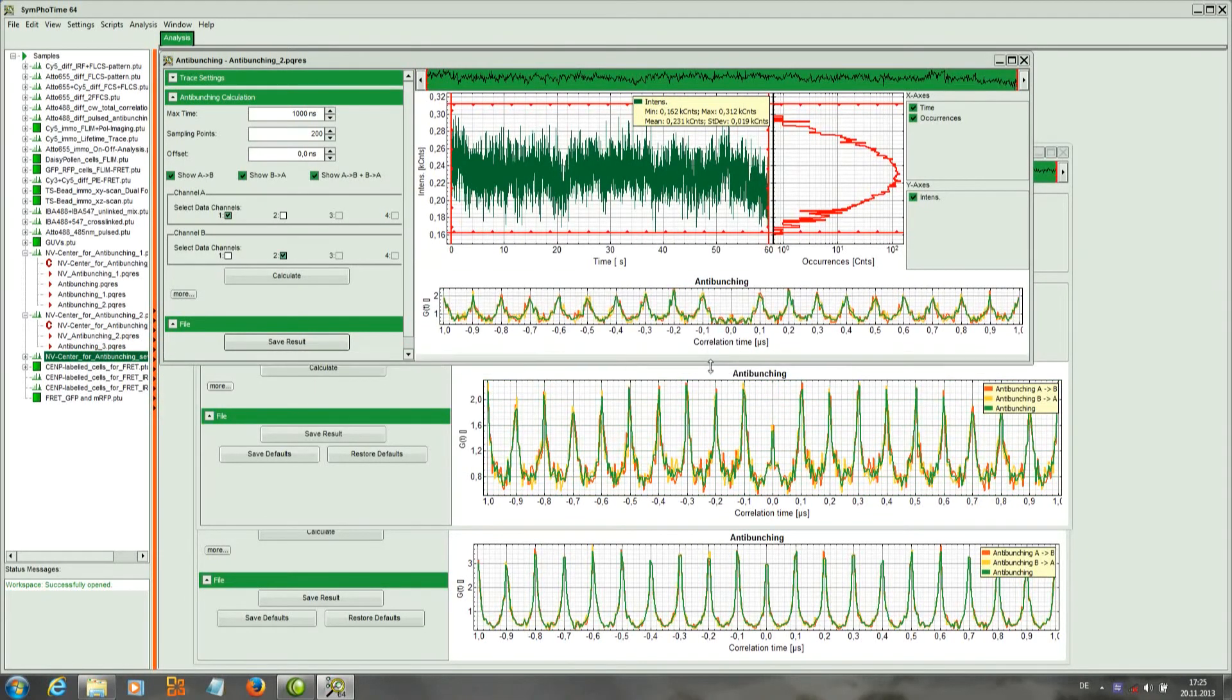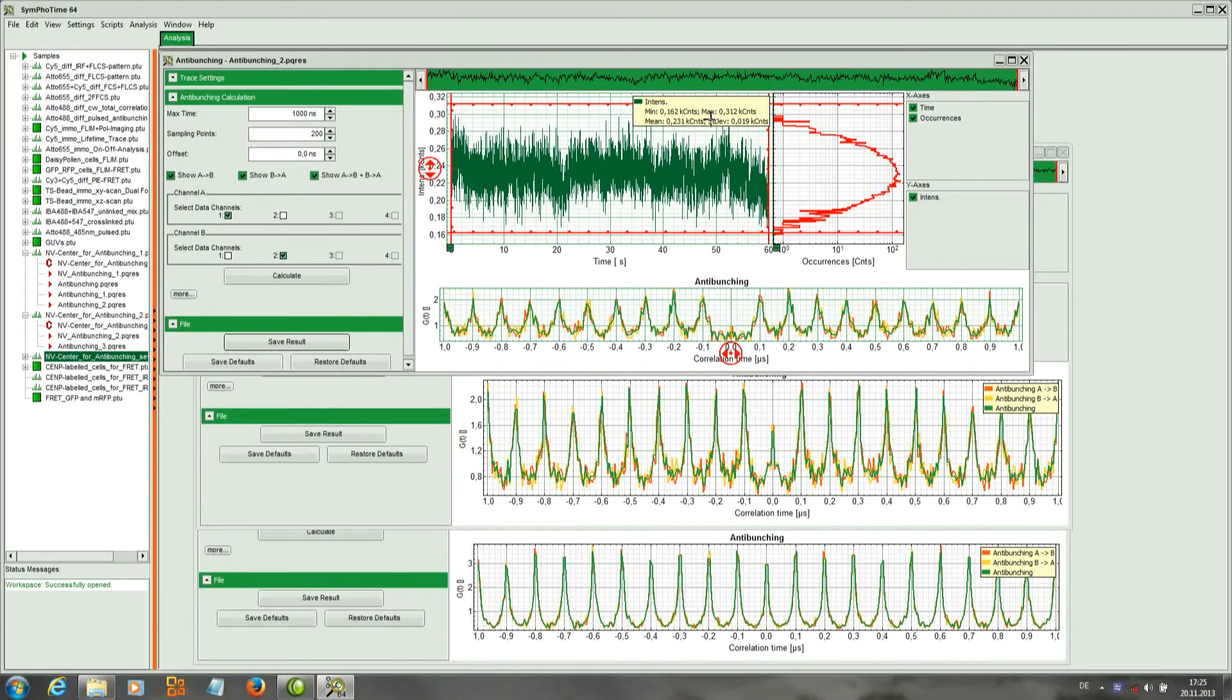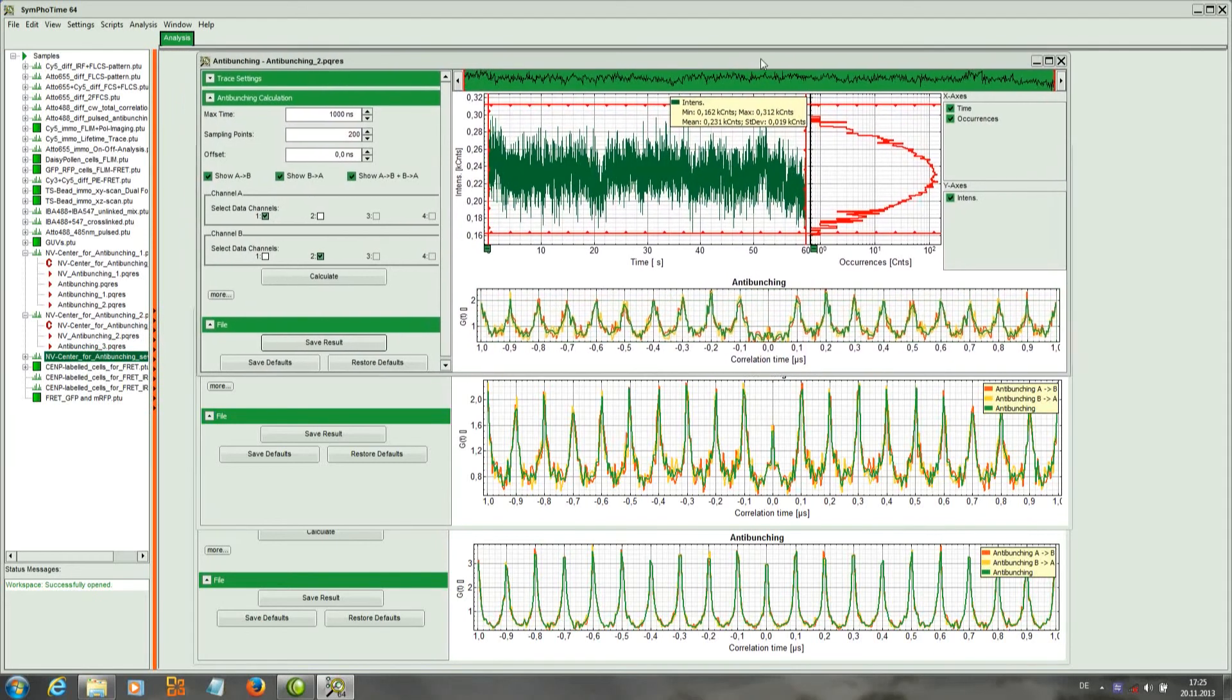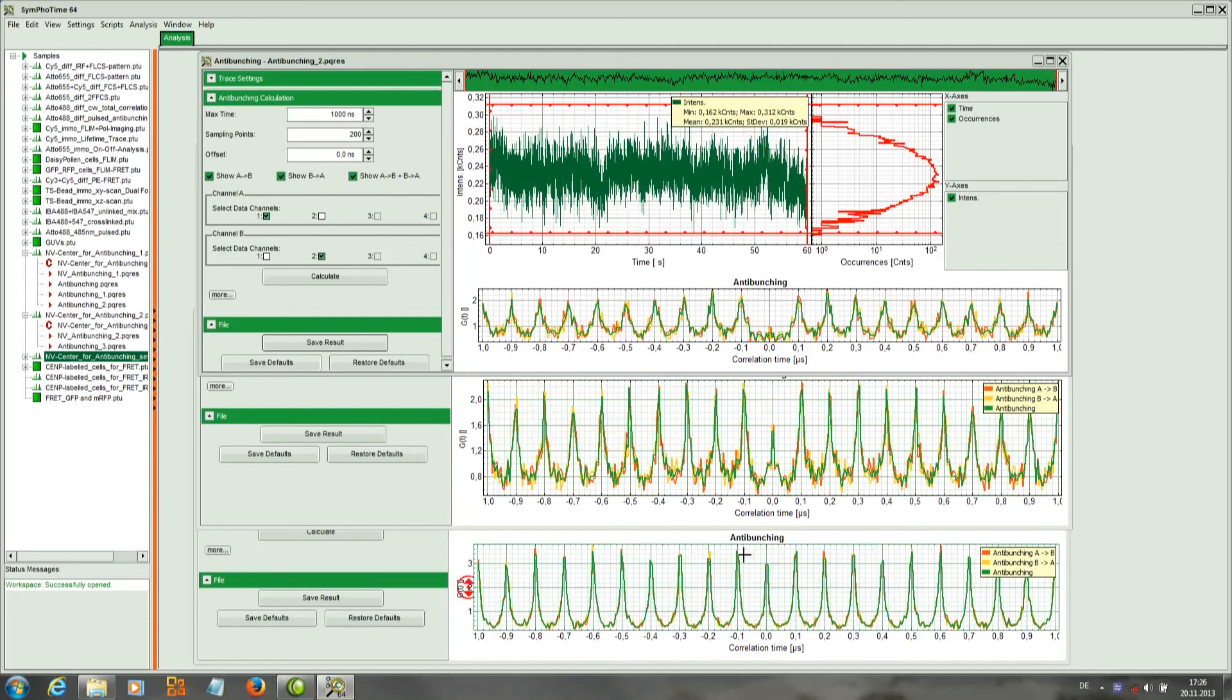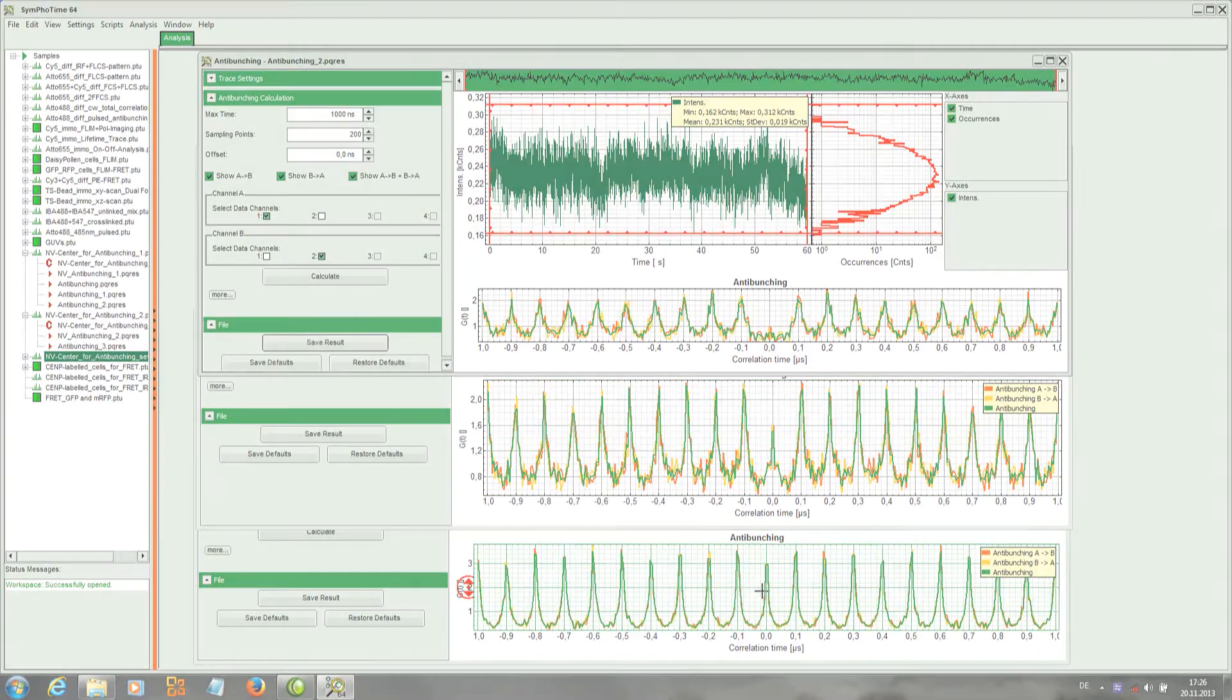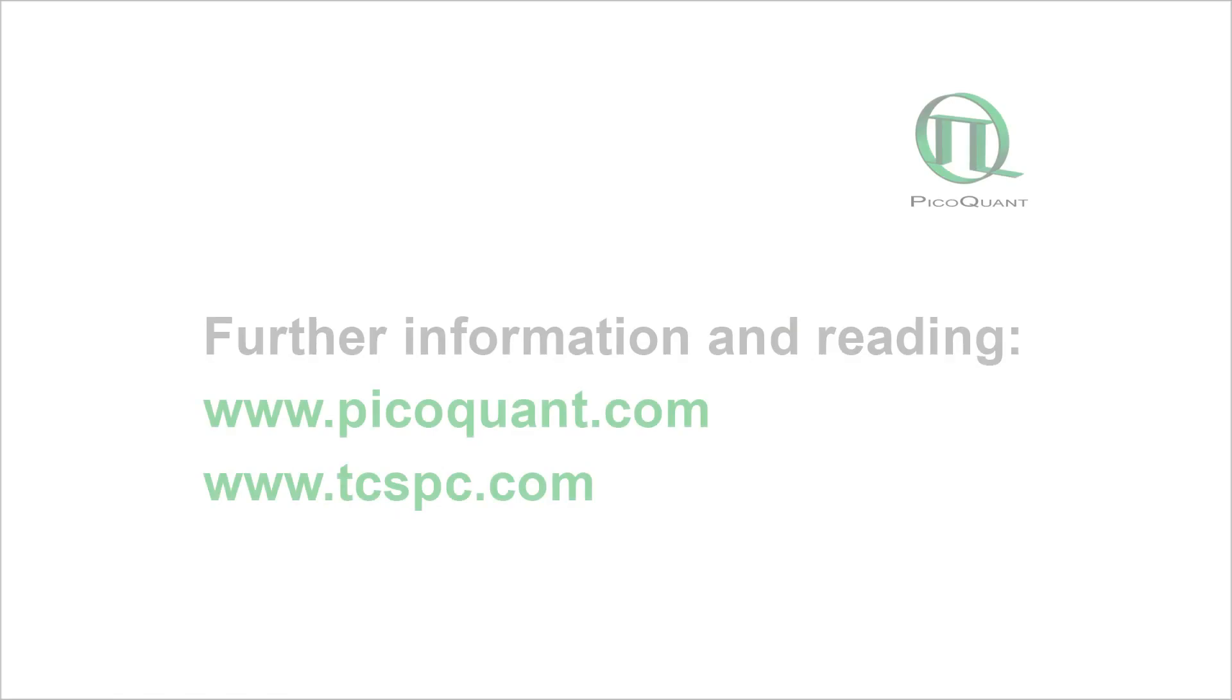So here we have basically one emitter, two emitters, and more emitters. So here we can see that.